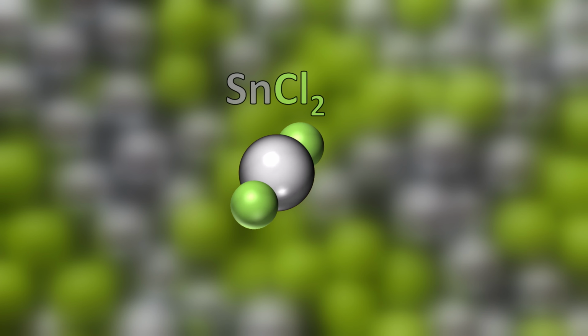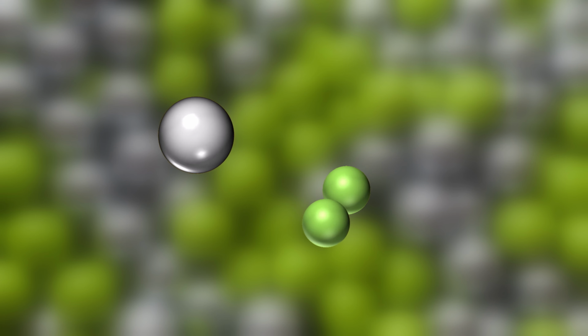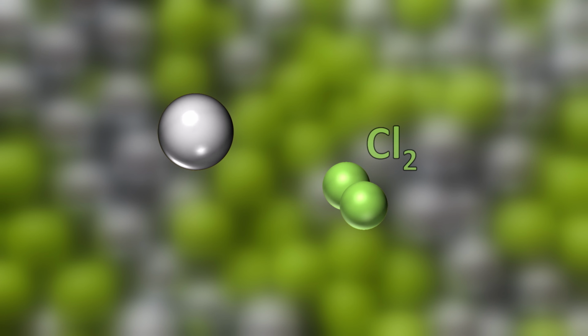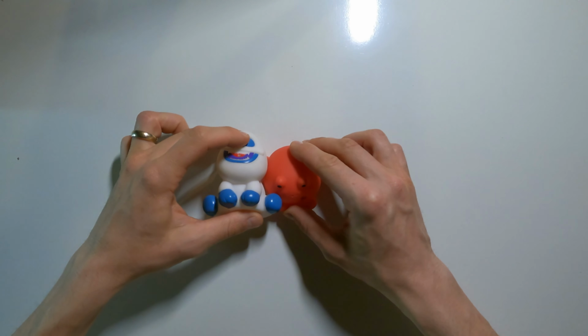Here's the tin chloride, and when we hit it with some electricity, it knocks the chloride off of that tin atom. The chloride atoms bond together and escape the solution as chlorine gas, Cl2. What's left is a tin atom. If you're trying to identify a decomposition reaction, the important thing is to recognize that these dancers started off together and then by the end of the night, they're dancing solo. So pretty interesting and kind of unusual example of a decomposition reaction.